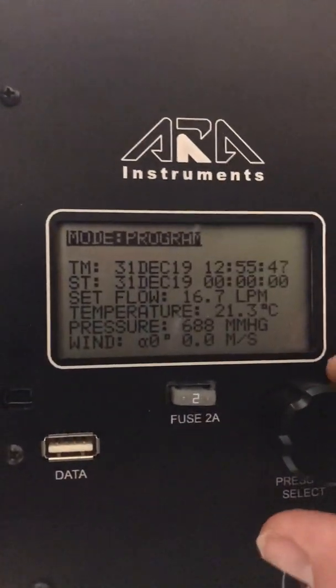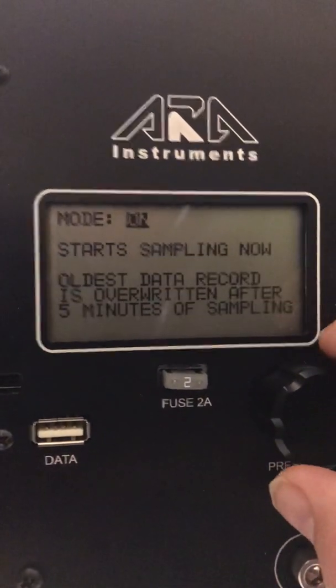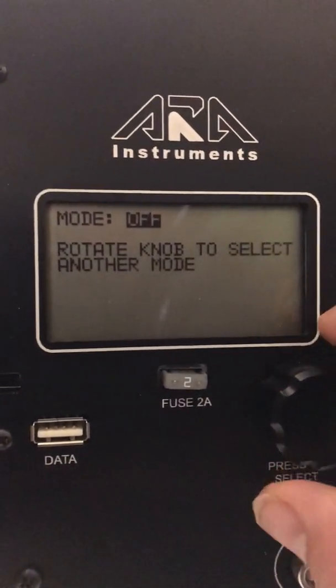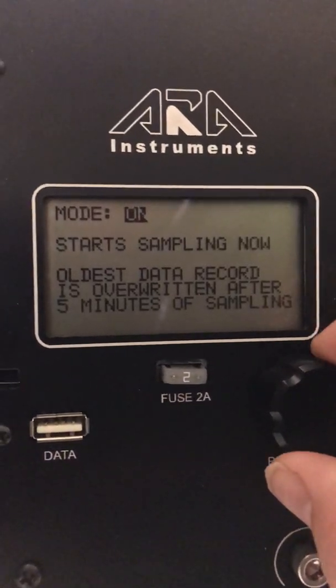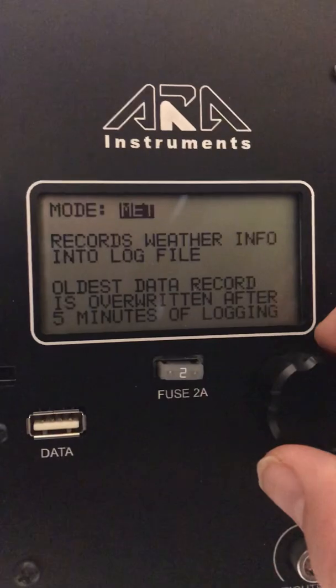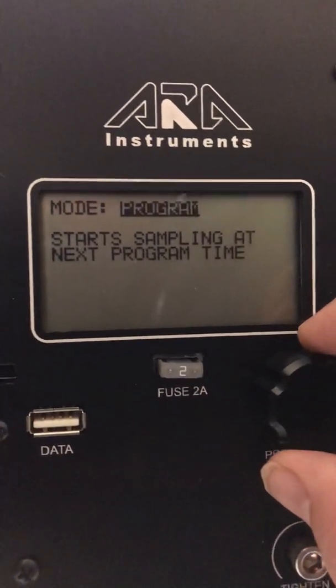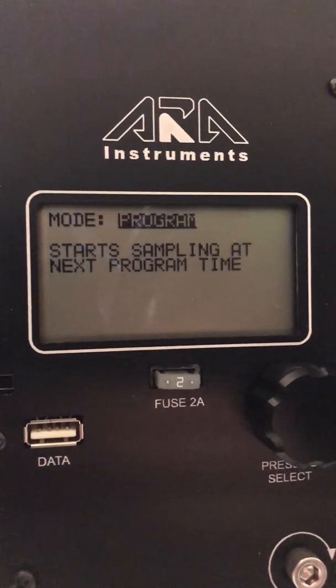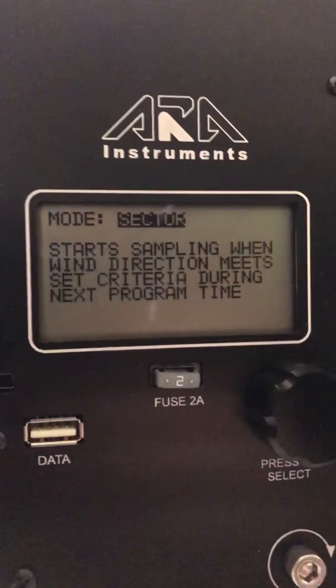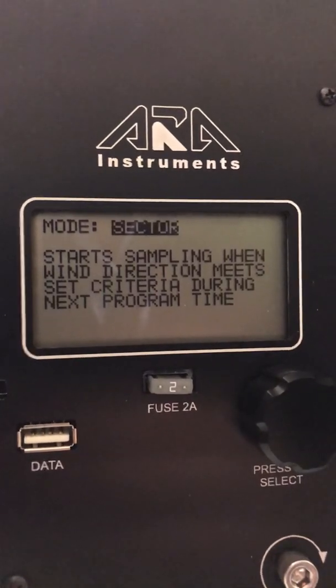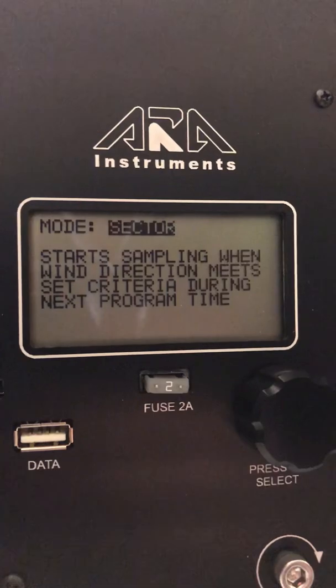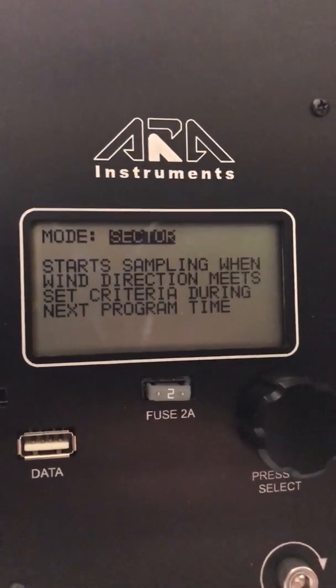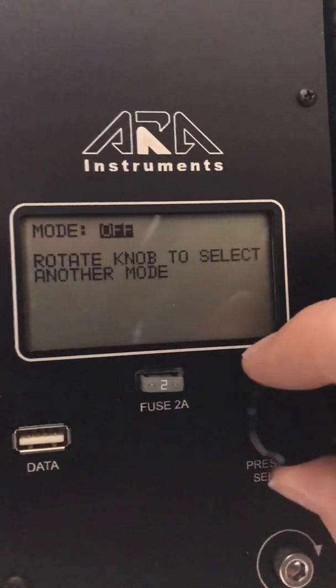We can have off mode, we can turn the pump on immediately in this mode. Here we can have the MET data collected into the log file. Here, this one is program mode where you can set midnight to midnight sampling. Sector is if you have a MET wind speed wind direction connected to this unit, and you can have it turn on based on which direction the wind is blowing from.